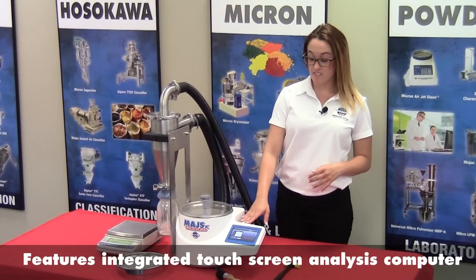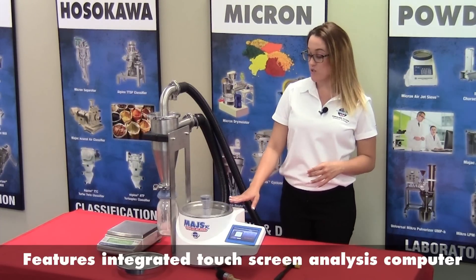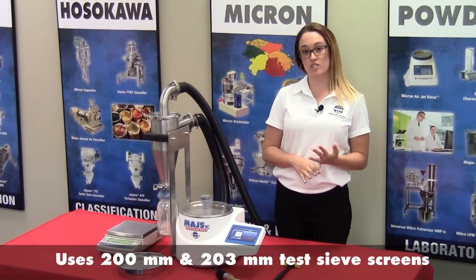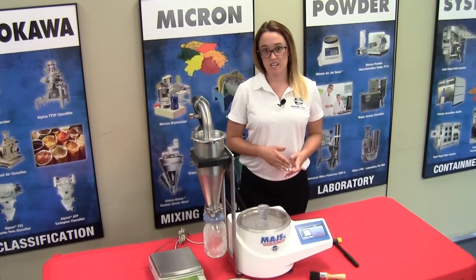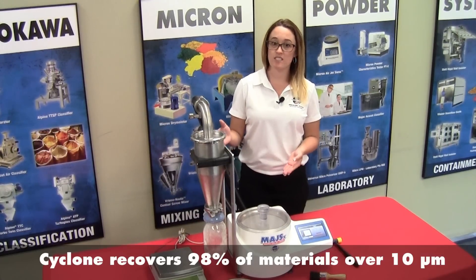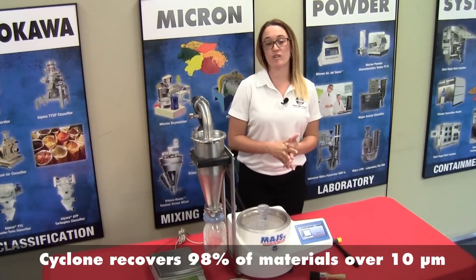Our Airjet Sieve is designed with a touchscreen integrated computer and is also designed to accept different size sieve screens — 200mm and 203mm. During this educational demonstration, we will be running the Airjet Sieve with the Cyclone, which is optional and collects anything 10 microns and higher for further analyzation.